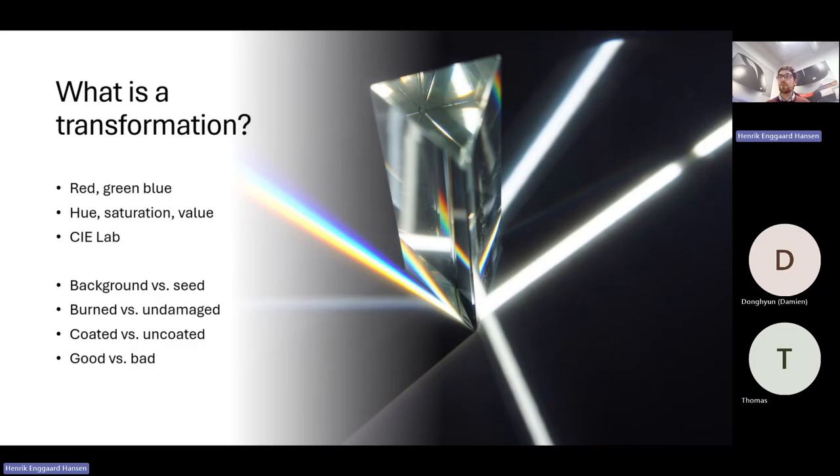There are two different versions, but common to both of them is that they try to approximate that any movement within this space corresponds to an equal change in how people perceive the color. So it tries to map something that is very close to how humans interpret colors. So all these three are transformations of color into some kind of more intuitive or more practical space.